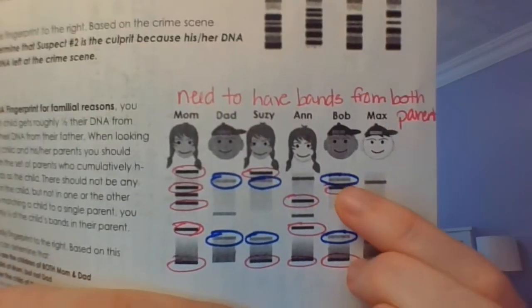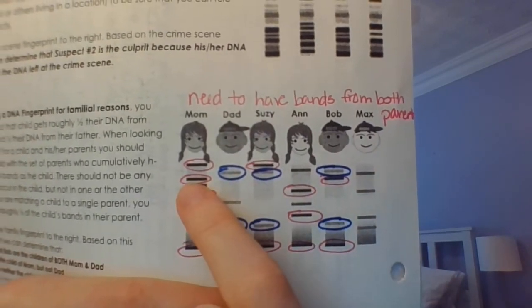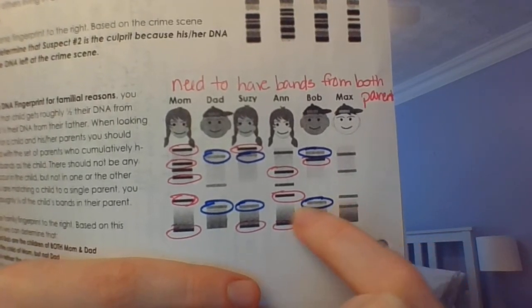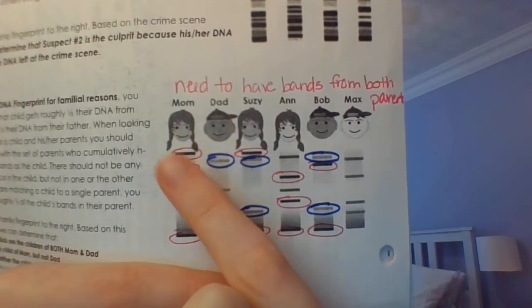You go to Bob. Bob's first band's right here. If you go over, it's from the dad. Second band's right here. If you go over, it does match the mom's. Third band right here. Oop, that's from the dad. And fourth band, that's from the mom. So Bob would be the child of both of these parents.